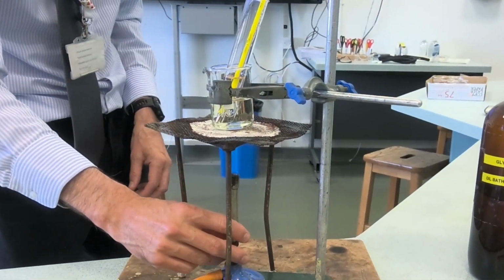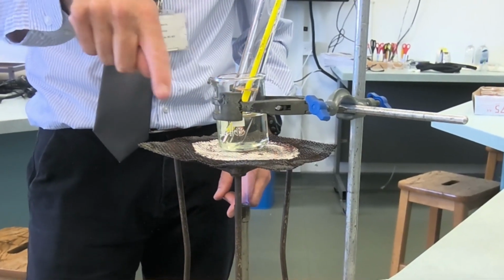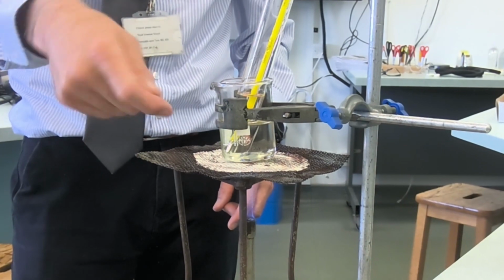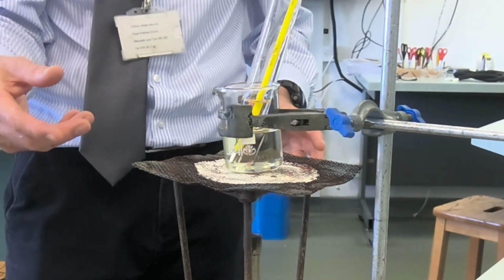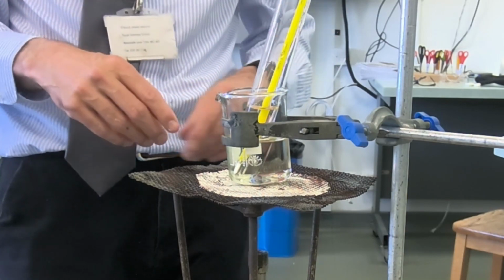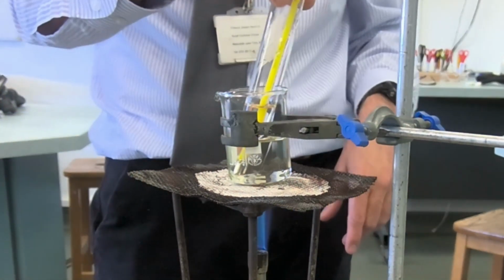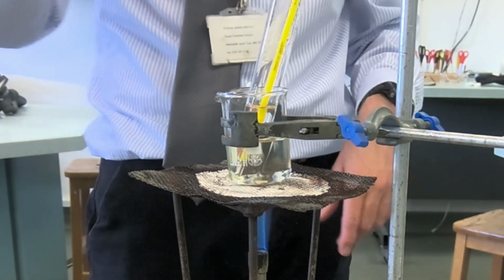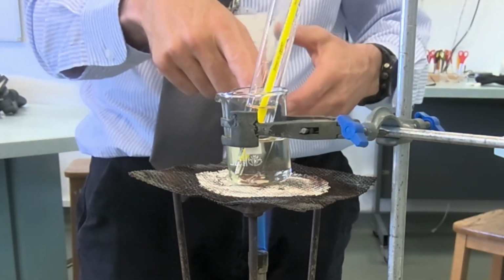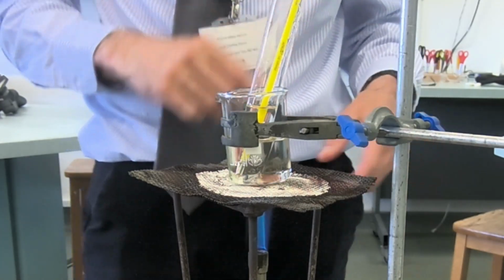Right, so what happens in here? If you've spilled glycerol on the mat, the gauze or whatever, then it'll start to smoke. It'd be a bit scary, but it shouldn't. The reason this is clamped is because it's a bit top heavy. If you haven't clamped this, it's very unstable. So we've got a clamp system, so it's not going to tip out and fall.